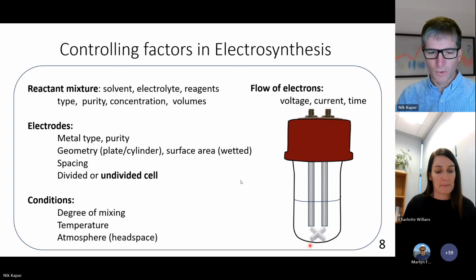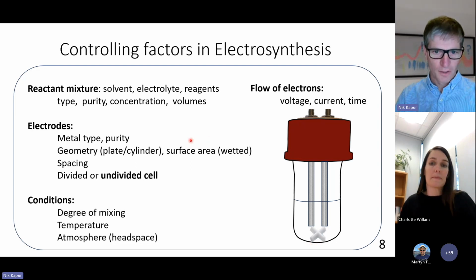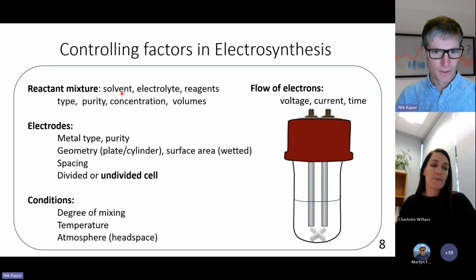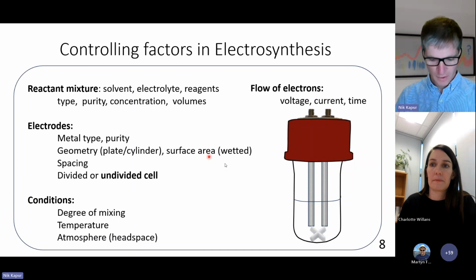So what we did after we started working in this area was sit down and look at all of the controlling factors around an electrosynthesis. And of course, some of these are around the chemistry, so things like the purity of your reagent, your solvent, the electrolyte that you might add in there. But quite a few of these are actually a result of the reactor itself.